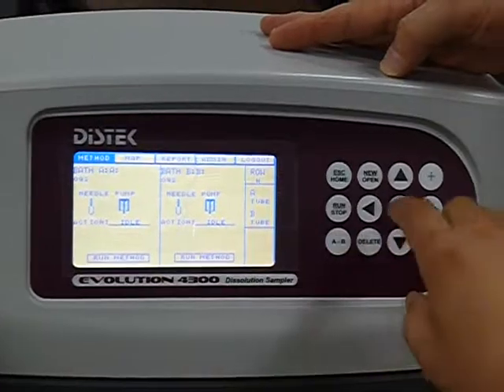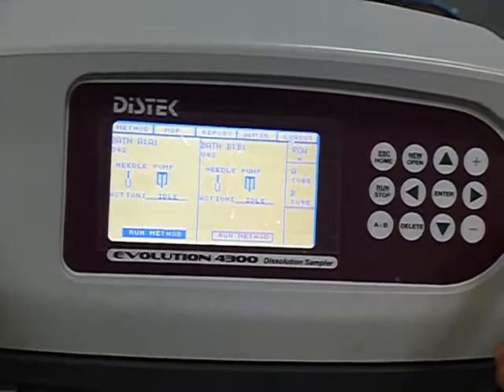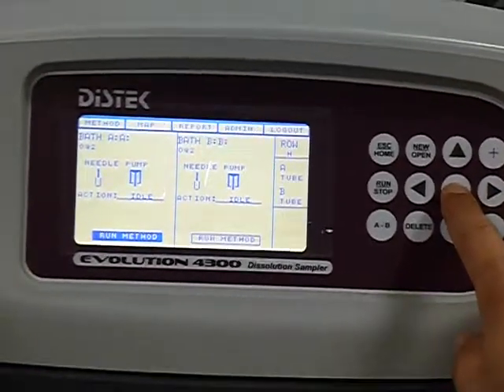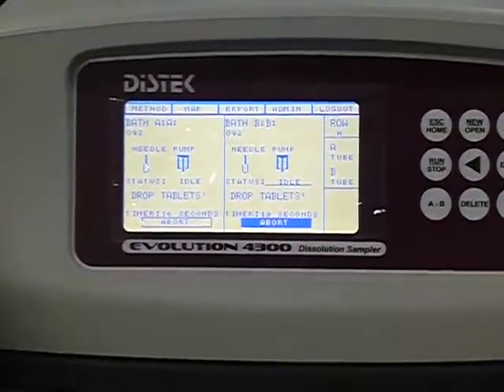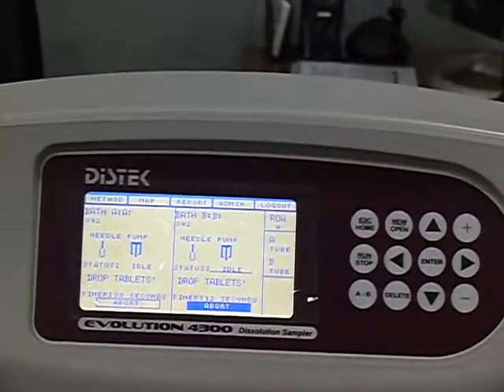It doesn't work. Oh, well, how can we run both simultaneously? It cannot be. Oh, no, not simultaneously. I mean, you can hit start run there and then click it over to the other one. There you go. You're going to be a second or two off. Now, sometimes they will, depending on the amount of time.